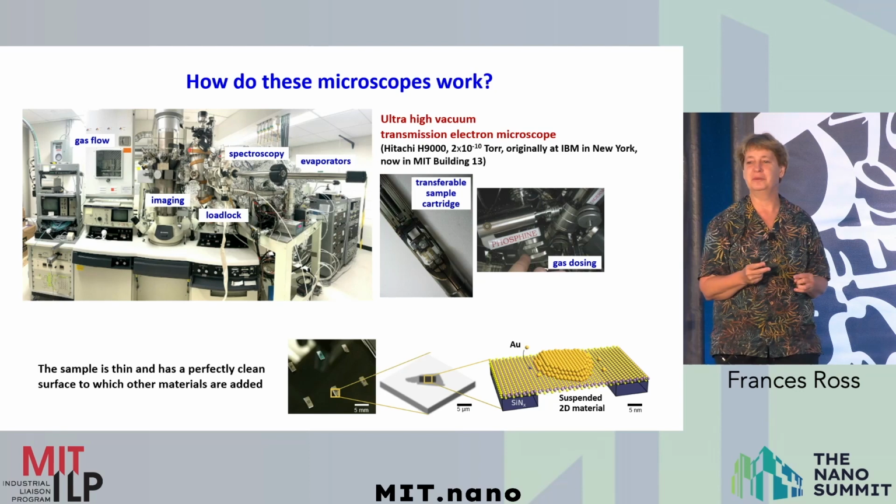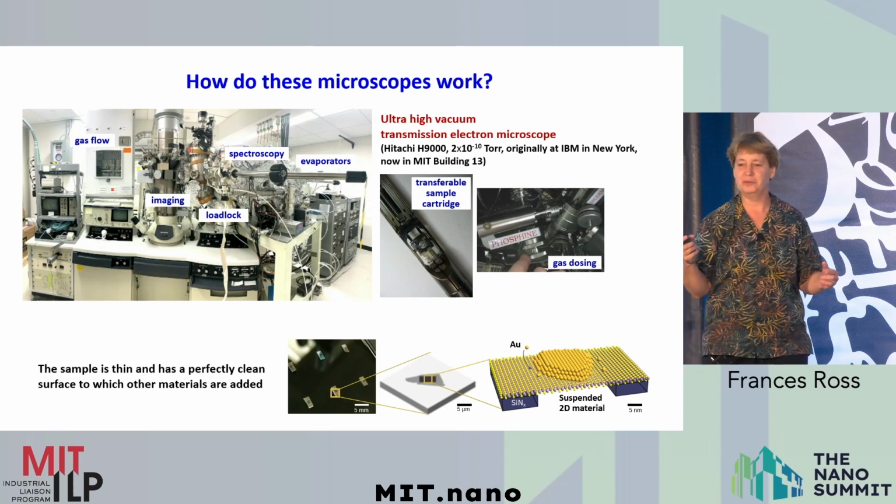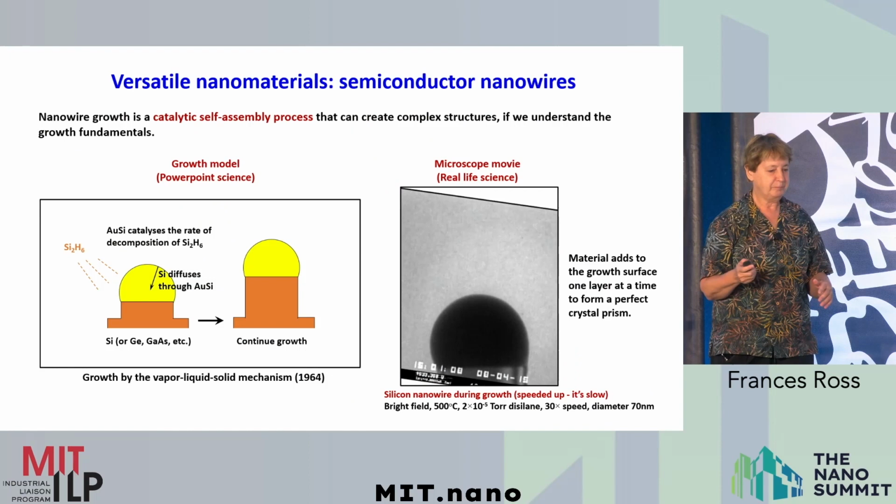When the sample is loaded in, it goes into this extremely well-controlled environment where, somewhat like in interstellar space, there just aren't that many molecules or atoms around to contaminate the surface. So you put the sample in, you clean it up, and then you have a perfectly defined starting surface to do the experiments. And the types of experiments are what I'm going to show now.